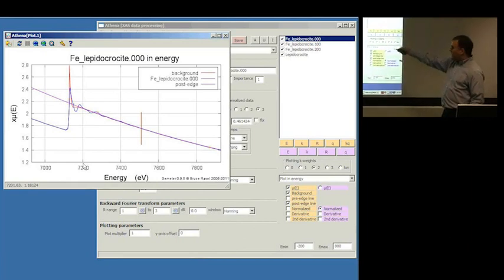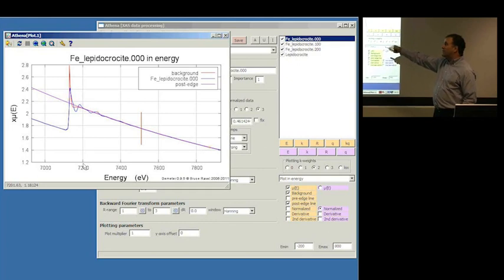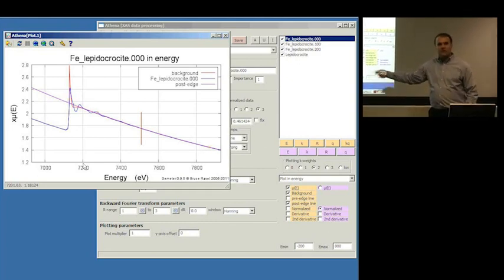So to account for that, we put a quadratic term on the purple line, which means that we've made it a little bit ambiguous where exactly it's going to cross here. And if it crosses a little bit higher or a little bit lower, when we normalize the data, this white line, and indeed everything in the data, is going to be a little bit smaller or a little bit bigger.